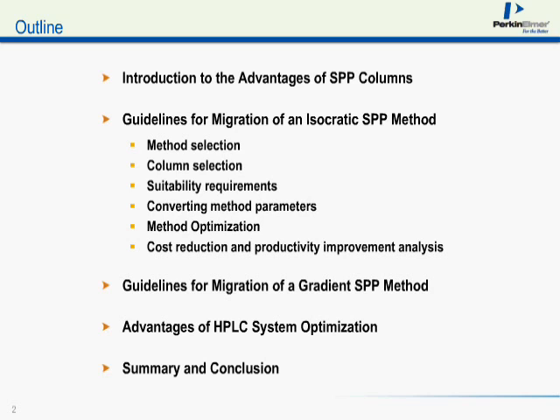And then we'll finish up with talk about some advantages of optimizing your HPLC systems for low dead volume in order to get the optimum performance out of the columns. And I'll summarize and then try and answer as many questions as we can.